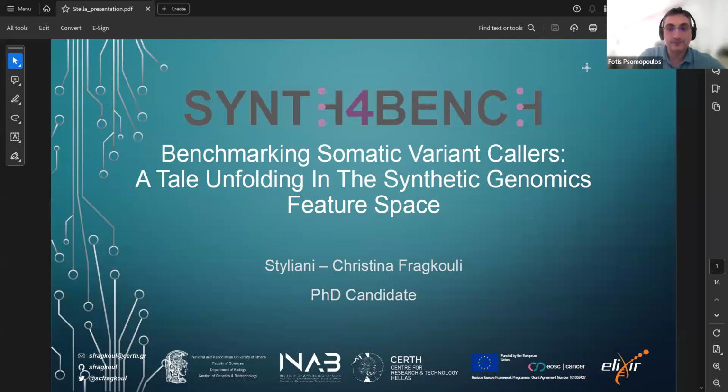Excellent. So in principle, what we have been trying to do was to somehow identify what is being called by the variants. And for that reason, we turned to synthetic data, which I'm going to take a few minutes to explain: what they are and what we try to do with them.